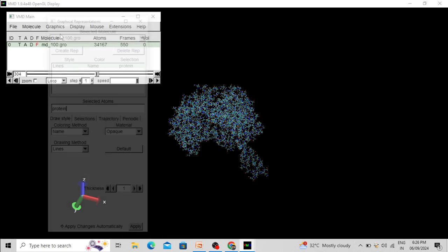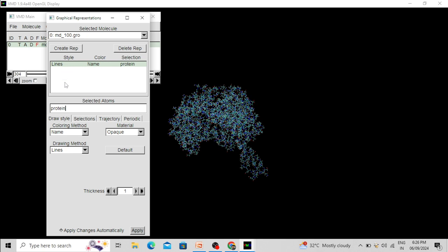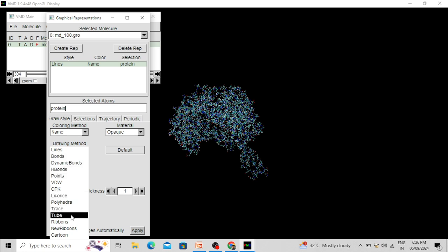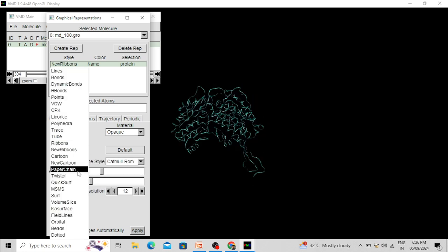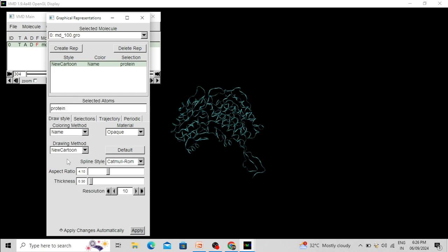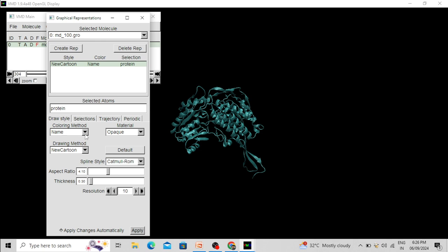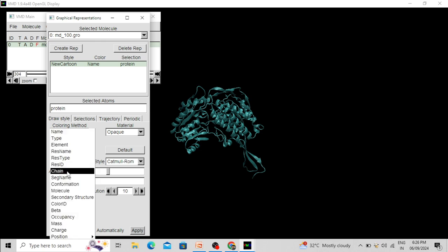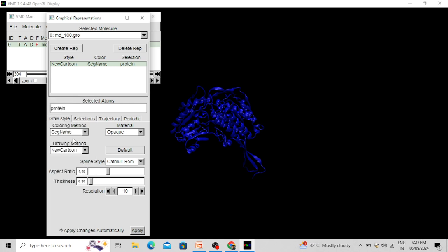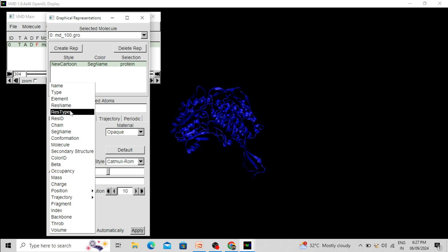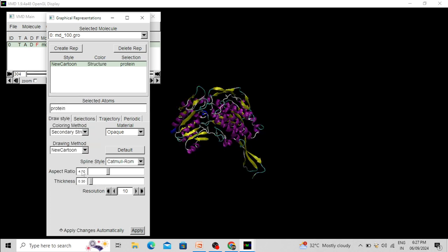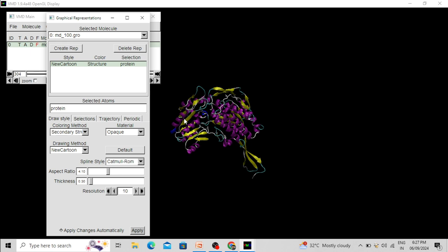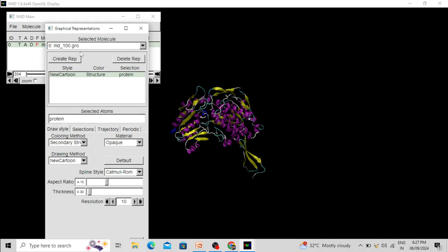The representation is currently in line format. You can change it to other formats like New Ribbon. I am changing it to New Cartoon. You can also change the color — I am changing the coloring method to Secondary Structure. Now the alpha helix and loop regions will be colored with different colors.